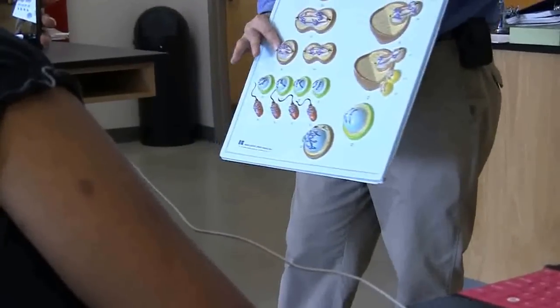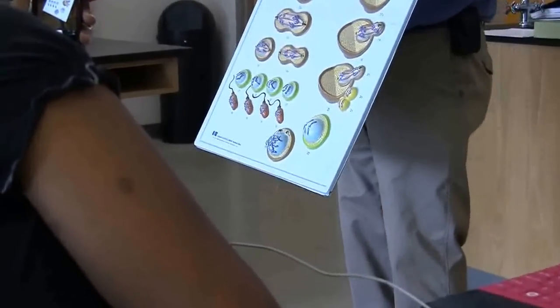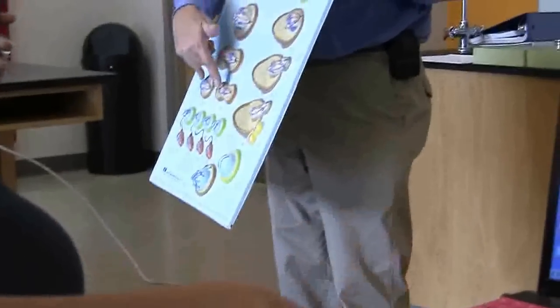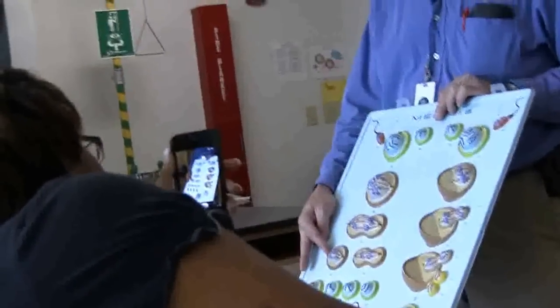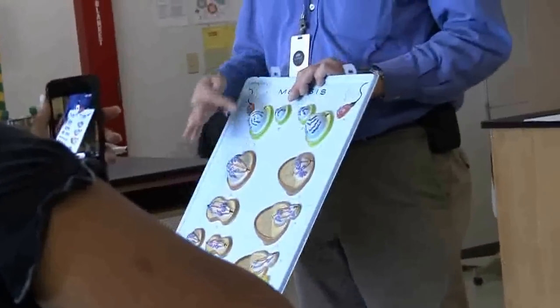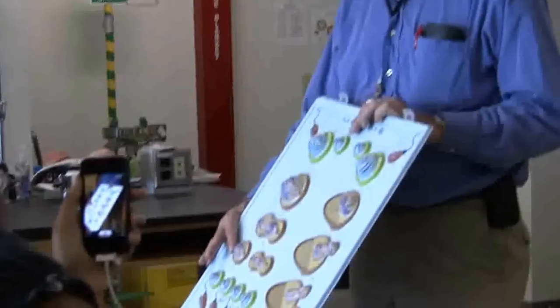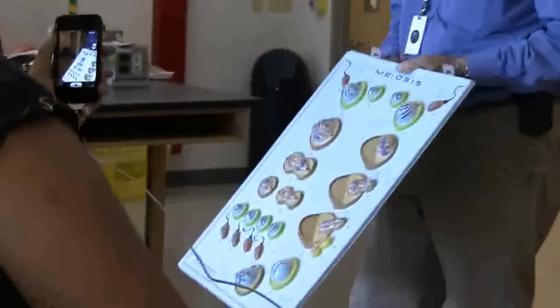What are these cells called? Secondary spermatocytes. At the end of meiosis 1, you have haploid daughter cells, the secondary spermatocytes. How can we tell that's a haploid cell? The chromosomes are not paired. We started with 6 up here. How many chromosomes in this cell? 3. Even though they're double-stranded, it doesn't make any difference. They're not paired, so it's a haploid cell.